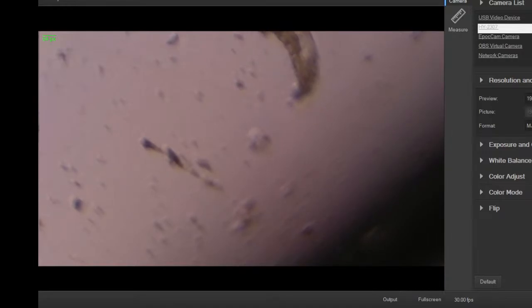and they have a survival function. Well, they'll basically go into stasis, and it's not just like a hummingbird going into a torpor kind of thing, like a temporary hibernation. They actually go into stasis where they curl up and kind of slow down their body function, and even kind of have this kind of gelatinous function. They kind of, not desiccate, but it's more gelatinous. They give it a name called a tun state, T-U-N.